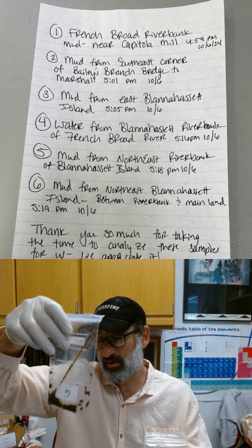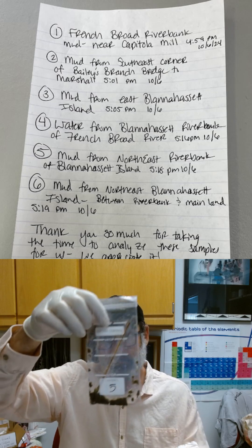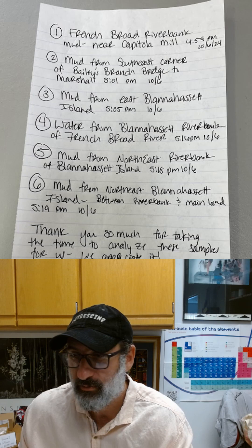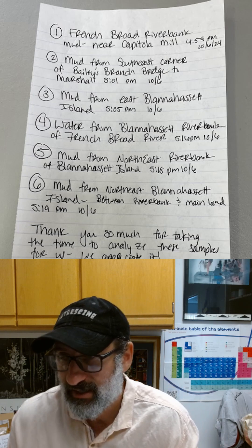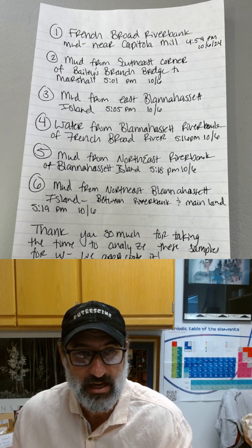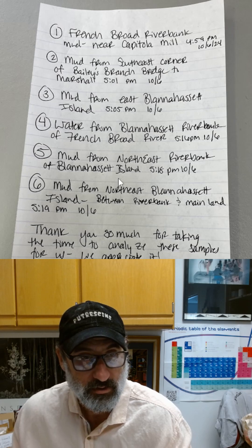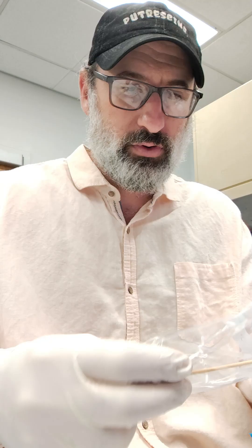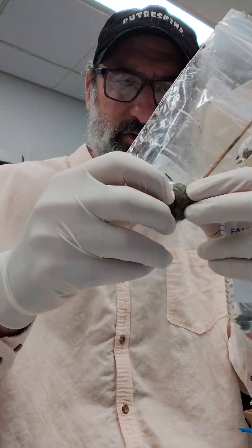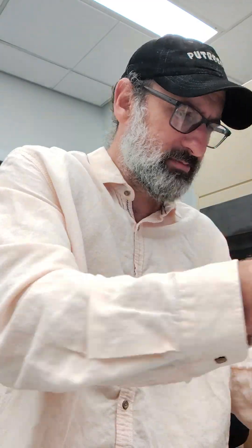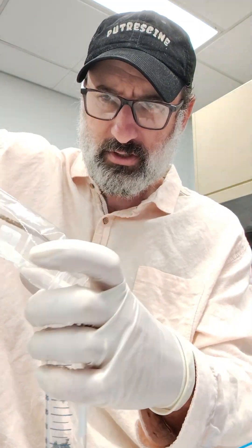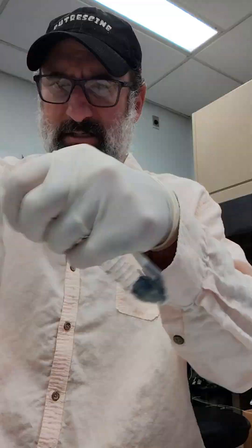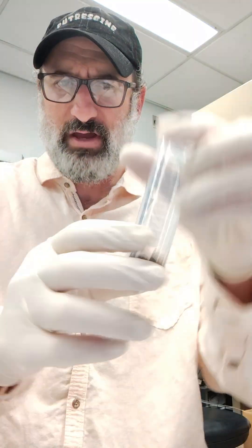So here I am going to combine all of the tubes to make an average. That was the first tube. This is the fifth sample. This is the third sample. We're not using the fourth sample. They're all of different consistencies and textures. We're just combining them all together into one tube to do a combined extraction. That was the second sample. And the last sample right there. So now we'll go ahead and extract them.